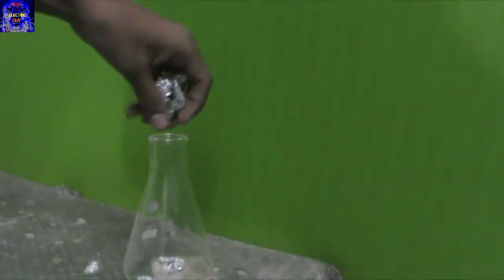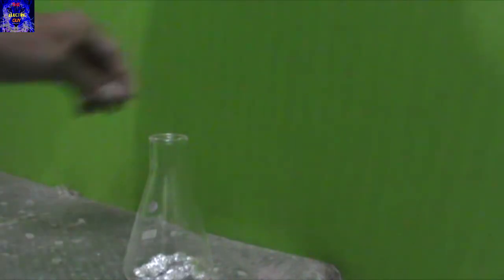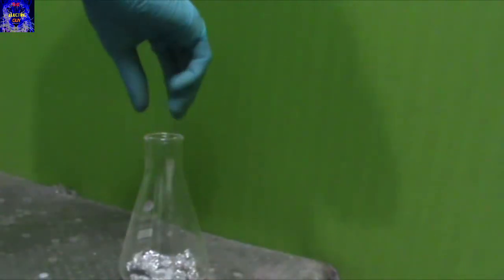After it is done, add aluminum foil pieces to a conical beaker followed by sodium hydroxide pellets.